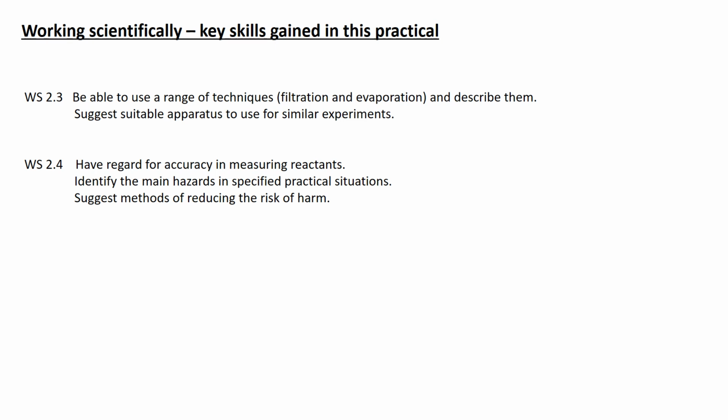Lastly, we're looking at the skills gained during this practical, and you need to be able to show understanding of a range of techniques, including filtration and evaporation, and describe them, plus suitable apparatus, plus risk assessing. And lastly, have a regard for accuracy of measuring reactants, main hazards, and suggest methods of reducing them.